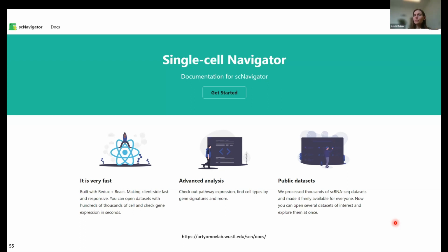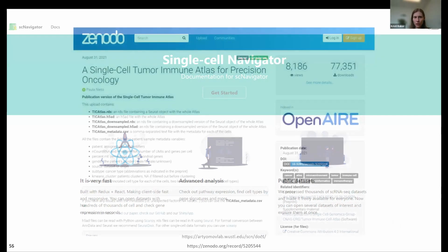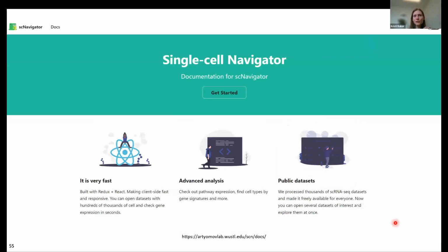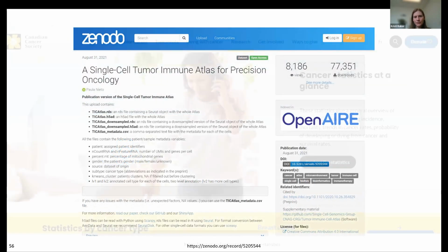So you can go in and you can do your UMAP clustering and things like that, and you can correlate it with pathology. It's a little bit more advanced than what we did today, but if you go onto these websites, you'll be able to figure it out without too much trouble. And again, there's a lot of really good tutorials on all of these. The other good one for single cell sequencing is called Zenodo. I prefer this one, but they're both good.